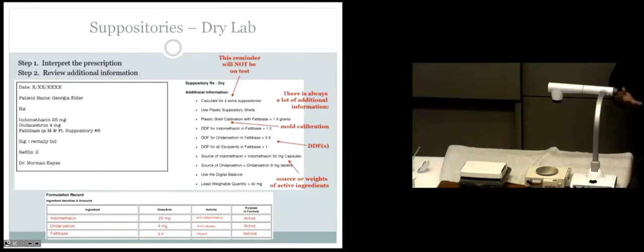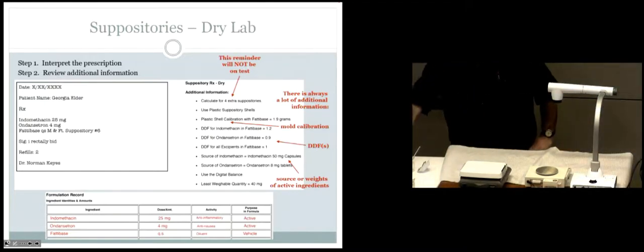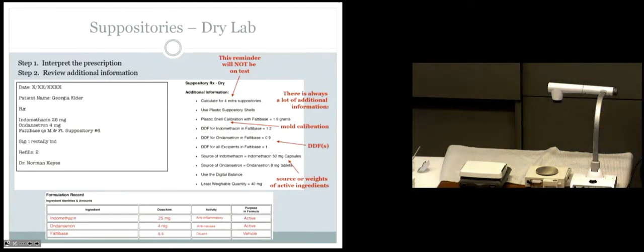I will direct you to what type of molds to use. As I remind you, these are disposable plastic molds. The ones you're going to be using today in lab are reusable aluminum molds, so I'll clarify that, and I'll tell you now, on the exam, you will be using the aluminum molds, the same molds you're using today. Part of the reason we're doing what you're doing today is so that you'll learn how to use those molds. So you will just get to replicate that process on the exam. I want to make sure you know how to do it. But we'll tell you which molds to use.